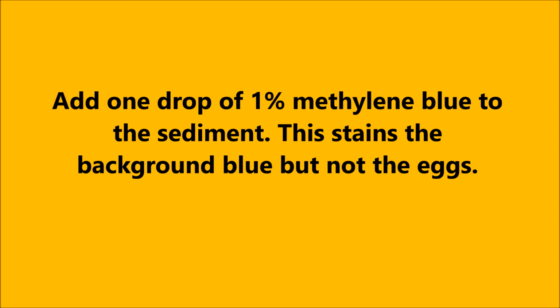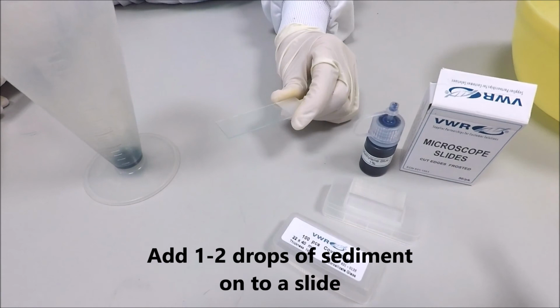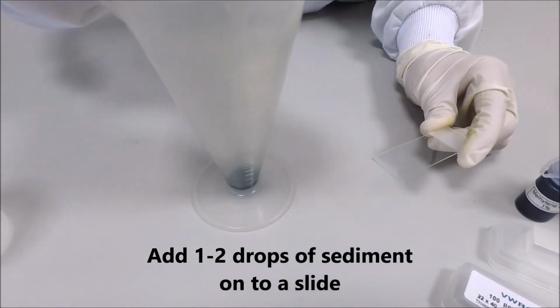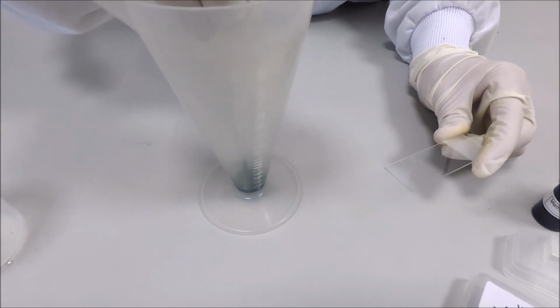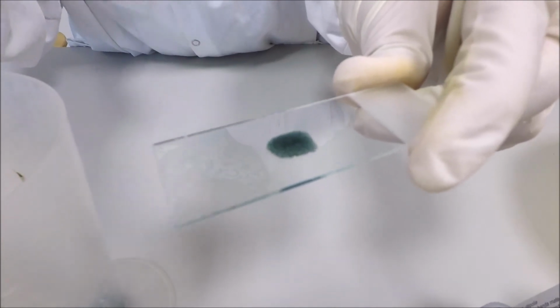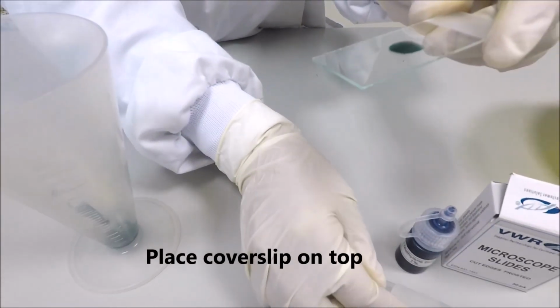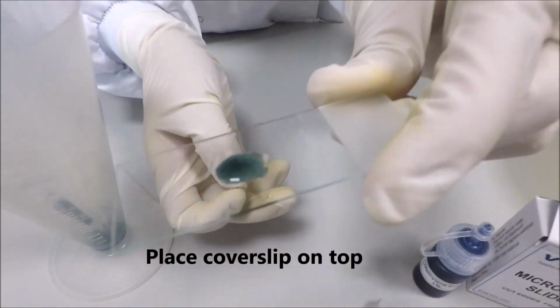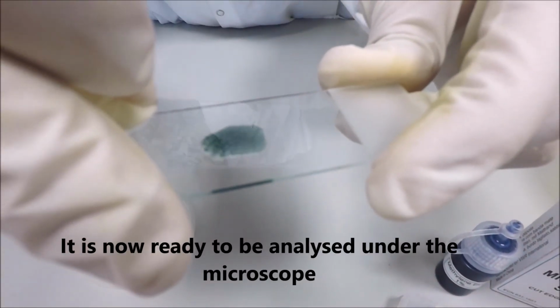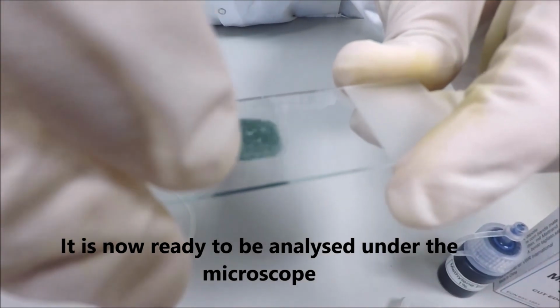Taking your methylene blue, add 1 drop to your sediment. This stains the background blue but not your eggs. Add 1 to 2 drops of your sediment solution onto a microscope slide. Place a cover slip on top to protect. Your sediment is now ready to be analysed under the microscope.